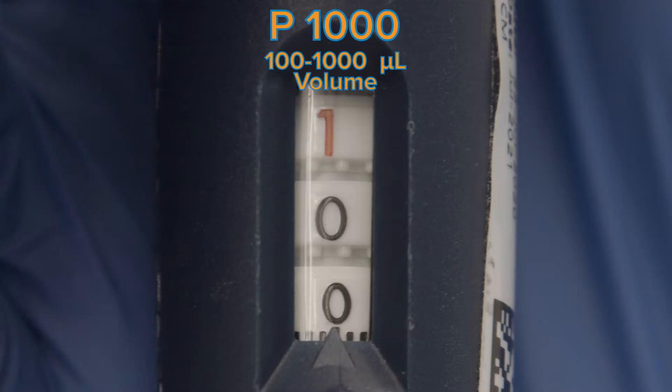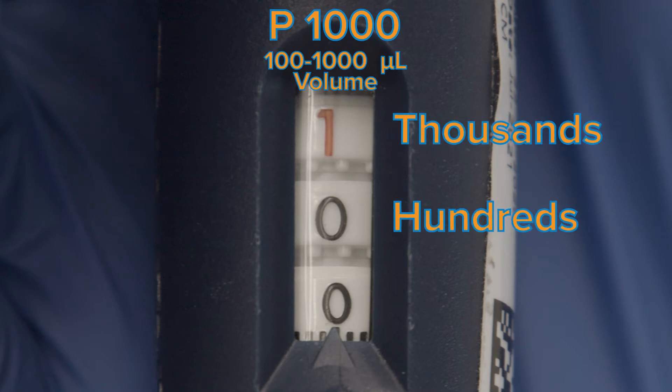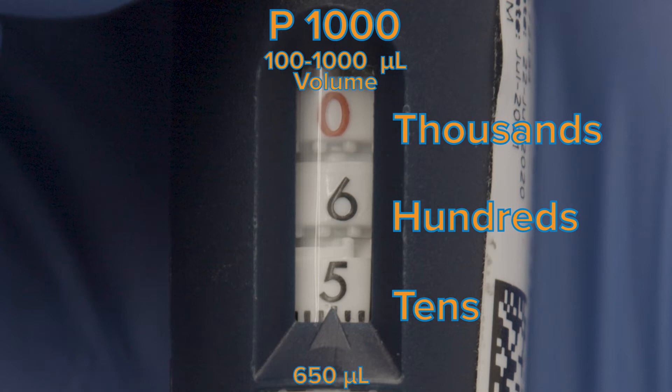For a P1000 pipette, the first red digit is thousands of microliters, the middle is hundreds, and the third is tens. So this is 1000 microliters, while this would be 650 microliters.